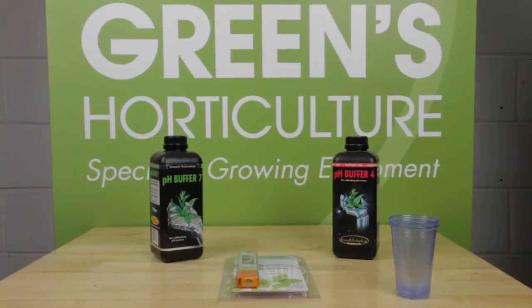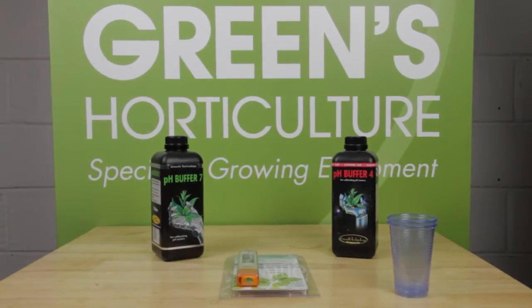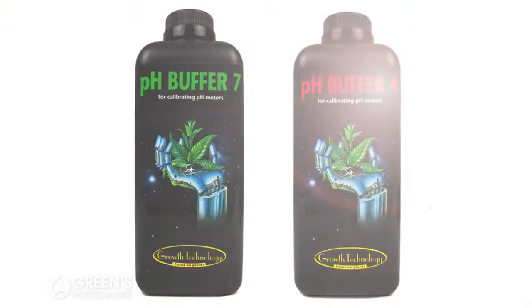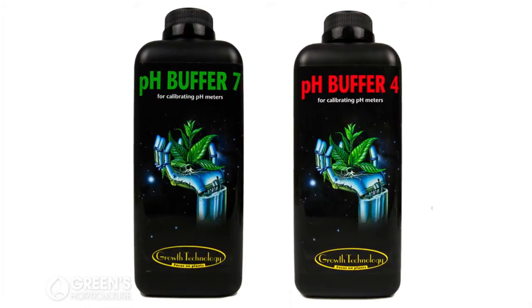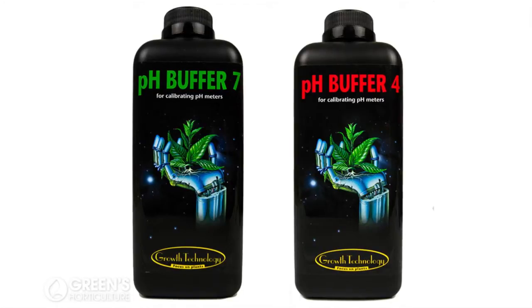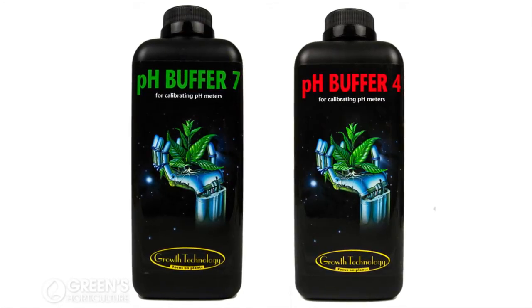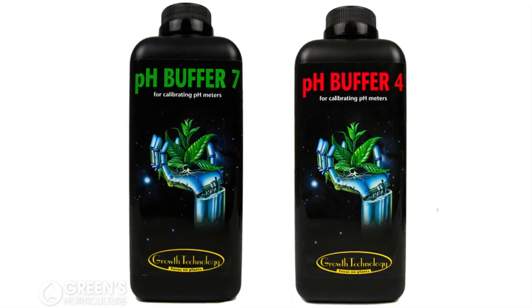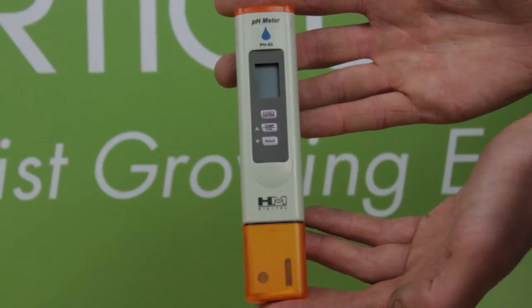For this you're going to need your pH pen, pH buffer 7 and pH buffer 4, and a couple of cups. We're using Growth Technologies buffer solutions for this demonstration, guaranteed to be exactly pH 7 and pH 4 respectively to enable you to calibrate your equipment.